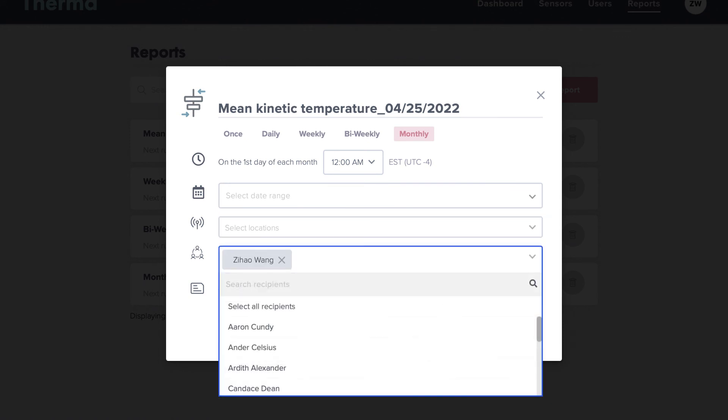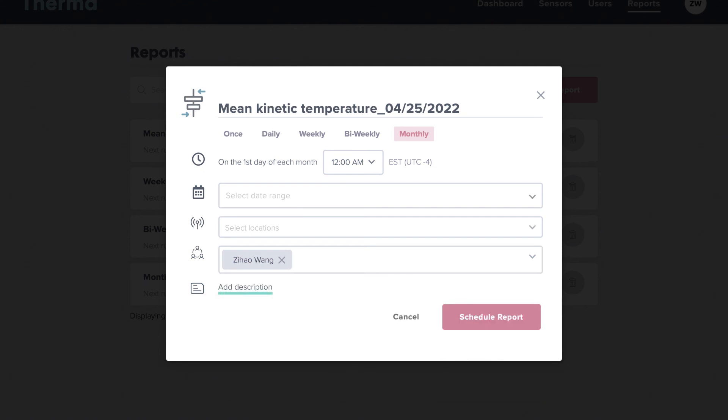Lastly, select a recipient. This field is mandatory and is who the report will be sent to. You can add comments to the report through the description field.